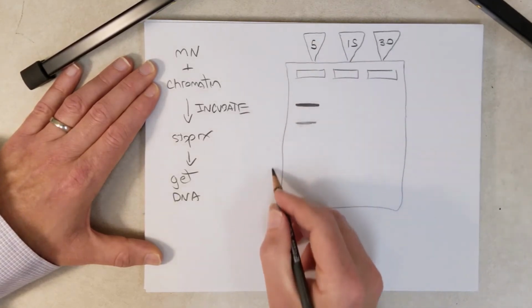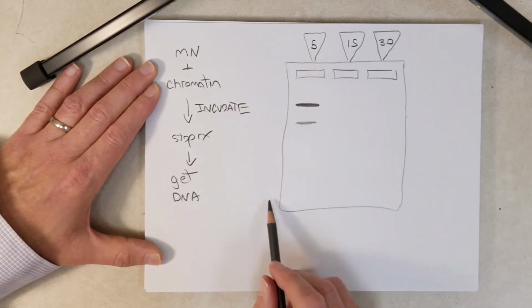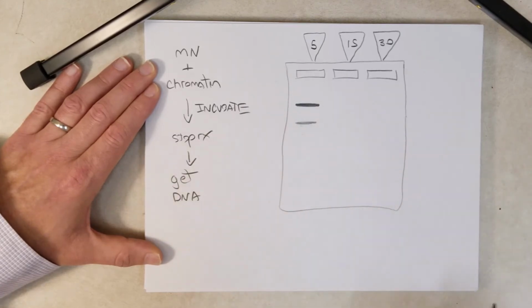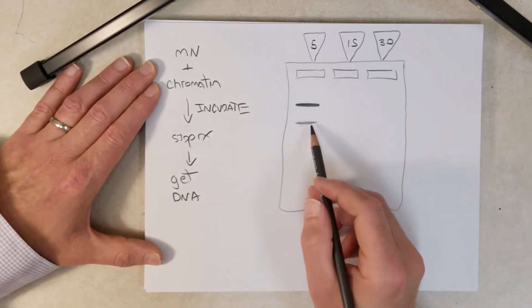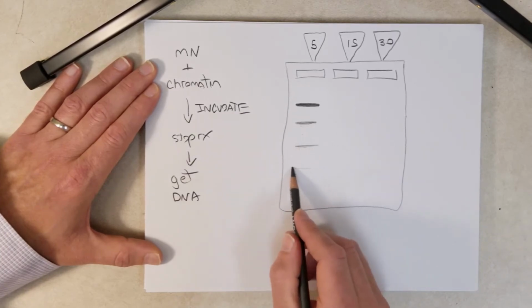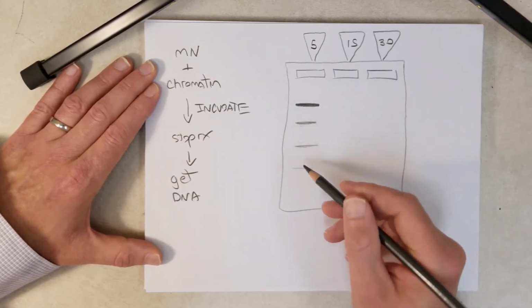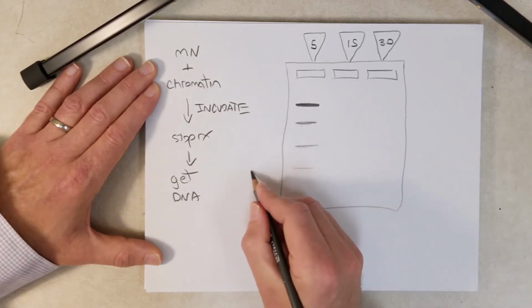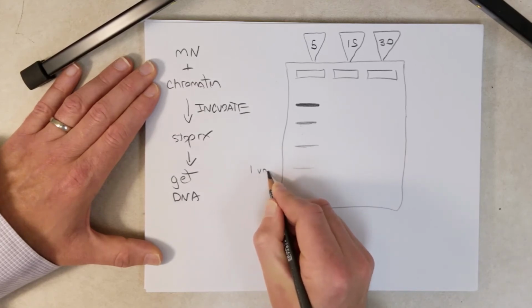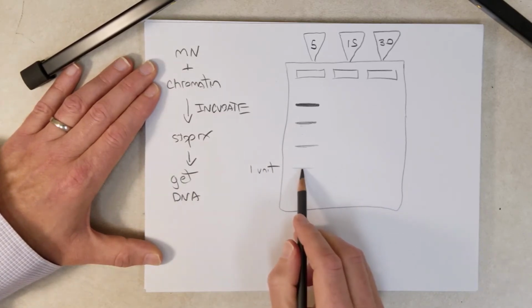So we separated the DNA by gel electrophoresis. The smaller length DNAs are down here, the longer ones are up here, and we stained it with a stain, say ethidium bromide, so we can see all the DNA. And let's say we see a pattern like this. And this is a laddering pattern. And this little band right here probably corresponds to the 1 nucleosomal unit. And this DNA would be about 146 base pairs long.